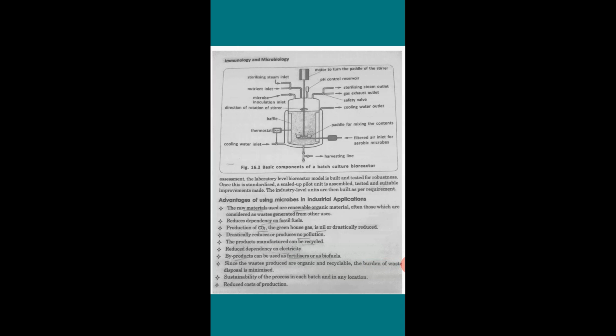Just like as you have seen in the case of sewage treatment, there will be aggregation of suspended particles and they will be settled. But if it happens during this bioreaction, it will be negative, because there should not be aggregate formation and settling. Instead, there should be consistent and uniform mixing of all solute and solvent here. So in order to prevent the foam formation and flocculent formation, there will be a foam breaker, that is here.